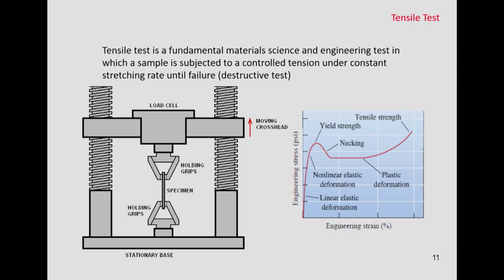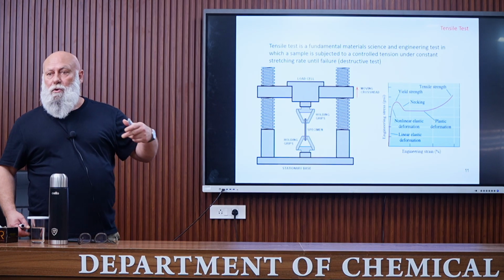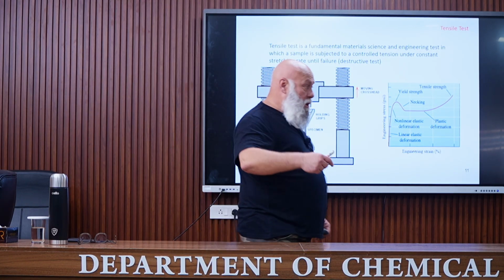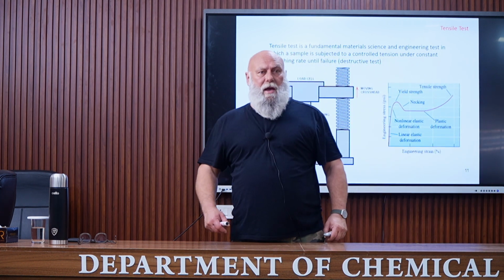So meaning that in this test, we have the force applied to the material as a function of its elongation. So you know that usually we don't use this raw data, but what is used is the force is converted into a stress, meaning that the force is normalized to a given section, and the elongation is converted into strain.